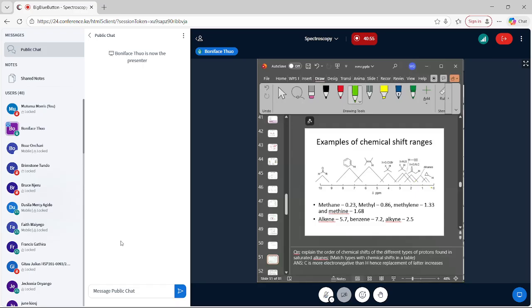When you see a peak in a certain region or a certain value of chemical shift appearing between, let's say, 4.5 and 7, an alkene proton, but also to some extent an aromatic proton or a proton attached to a carbon also bearing an electronegative element.